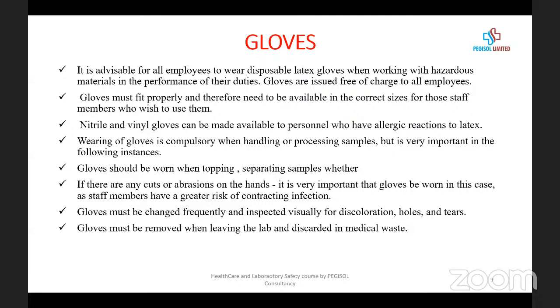Gloves must be changed frequently and inspected visually for discoloration, holes, and tears. So immediately you discover that there are holes, there are tears, or there is a stain, ensure that that glove is changed appropriately. Please, gloves must be removed when leaving the lab and discarded in medical waste. Very, very important.